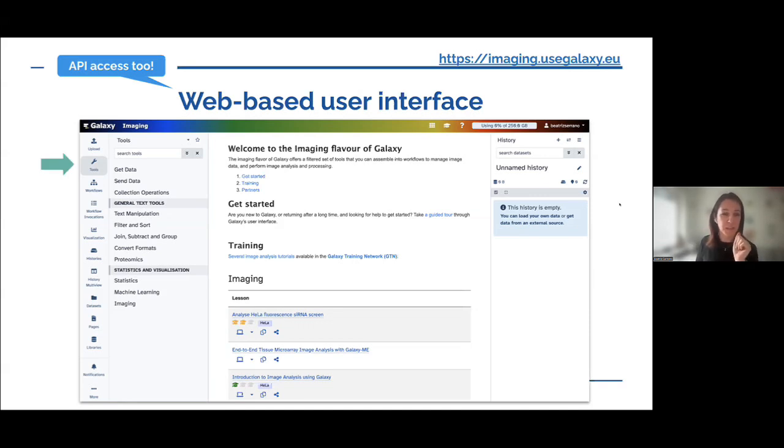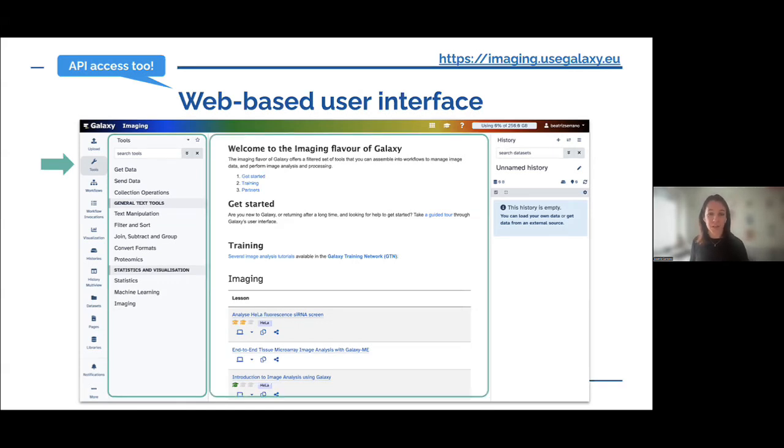Okay, so let's go step by step. There are the tools. Once we have the tools selected here, one can see a panel with all the different tools. You can search for them, but we already pre-filter the ones that might be relevant for imaging. Then we have a central panel in which all the information is explained. Whenever you're going to run a workflow, use a tool, or anything that is changing, it is going to happen in the central panel. In this case, this is the entry page. So we have a basic summary of the training and so on. There is just basic information now, but this will change whenever you use it.